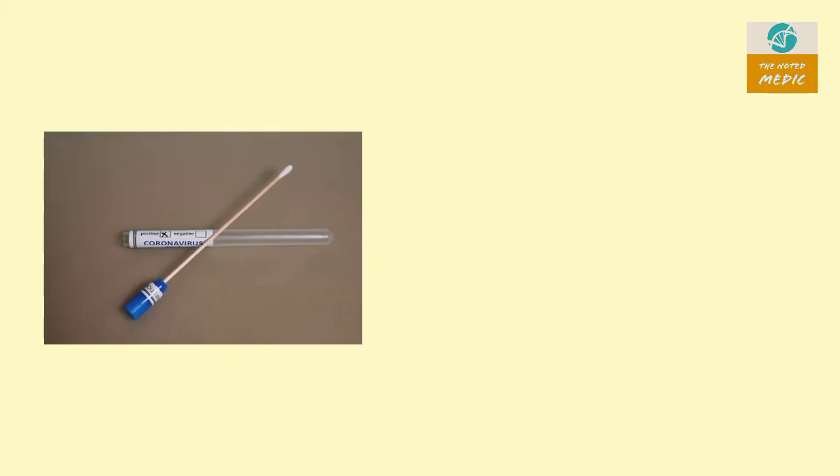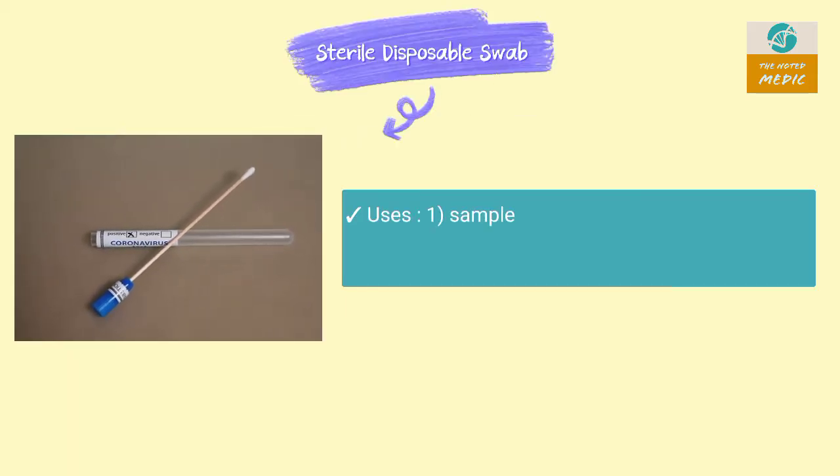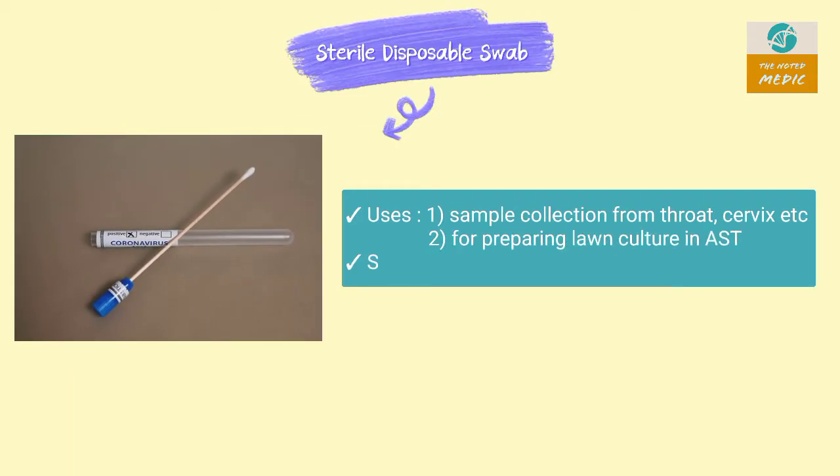This is a sterile Disposable Swab. It is used for sample collection from the throat, also used in lawn culture preparation, and it is sterilized by gamma radiation.